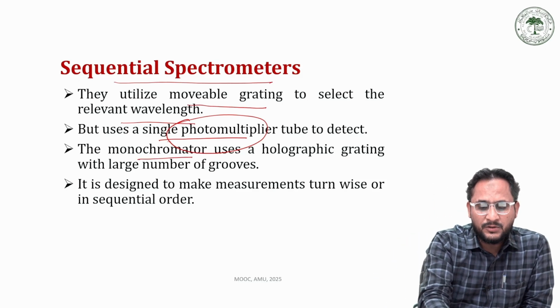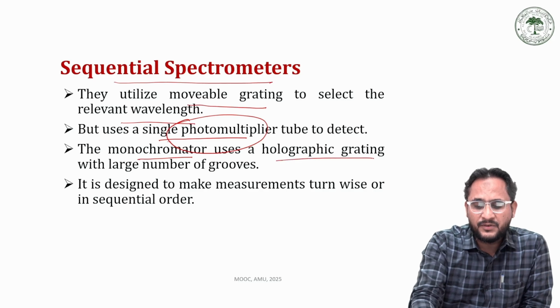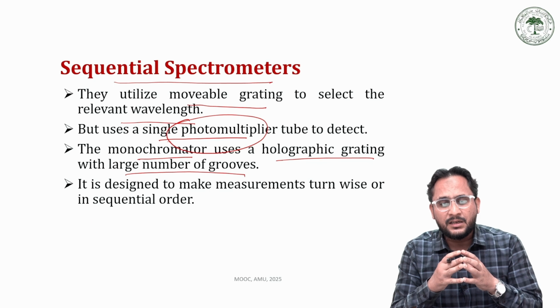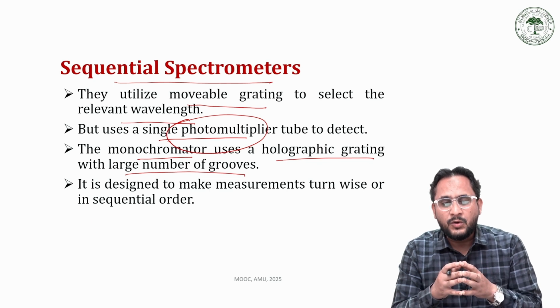Sometimes these monochromators use a normal grating, but sometimes we prefer a holographic grating, which has a large number of grooves, which can narrow down the light radiation to a greater extent.